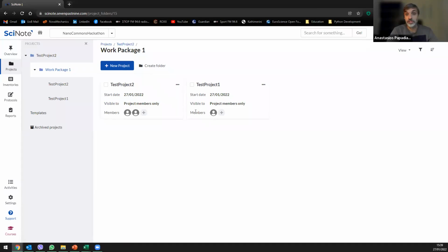It's a good idea, as we will see, to have a master environment where you have your workflows and then move these workflows around without having a lot of people in this folder.